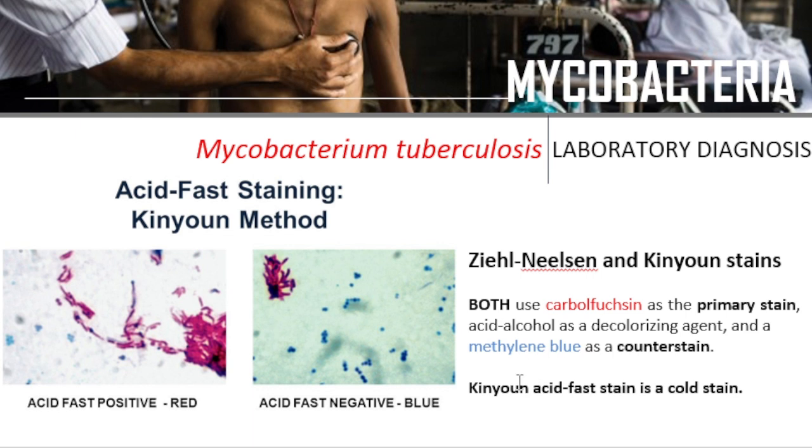Now, the Kinyoun acid fast stain method is a cold stain. It has the same principle as the Ziehl-Neelsen, except that no heat is applied. So it has carbolfuchsin, acid alcohol, and methylene blue, compared with the Ziehl-Neelsen, where heat is added as the mordant. Now the acid fast positive bacilli take up the primary stain, the carbolfuchsin.